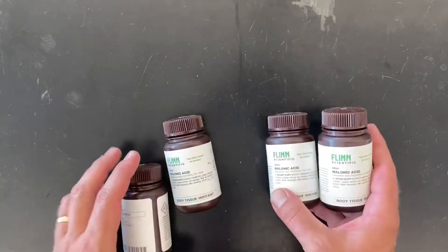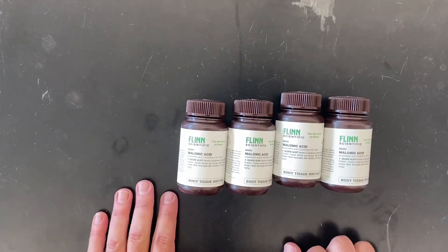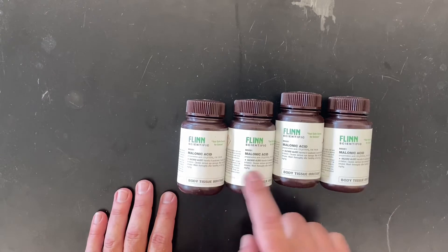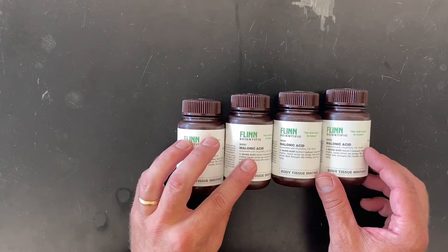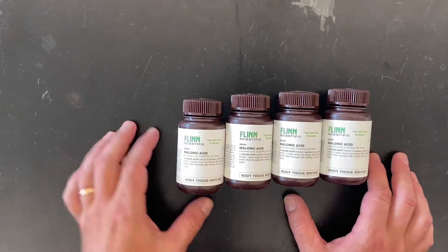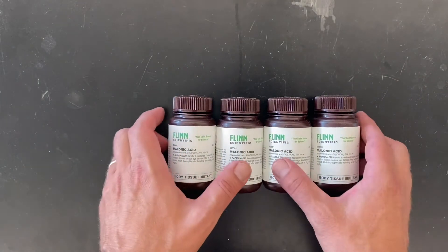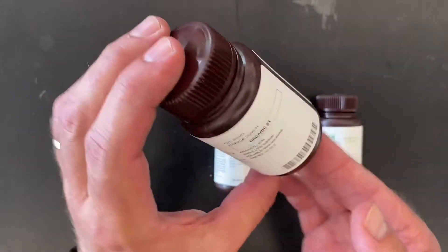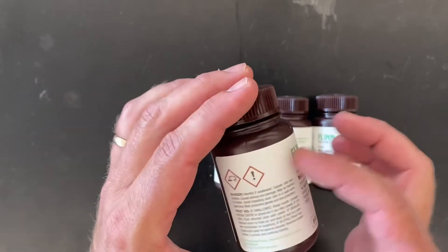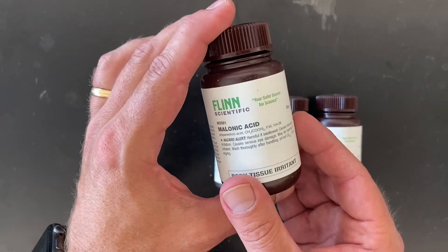We'll keep going with some malonic acid. They put a lot of the solid acids in the same box, which makes sense. We have four bottles of 25 grams each, used for some redox reactions and demos later in the year. These are also light sensitive, so they come in brown bottles so that light can't get in and cause them to decay or degrade.